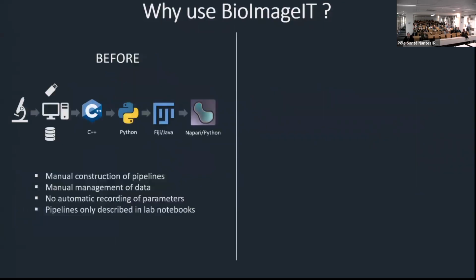Why should we use BioimageIT? Because there is here an example of a pipeline. You have your raw data, you stored it maybe locally or on a remote database, and you want to do some denoising or some deconvolution or tracking, and then you want to visualize your processed data. But you have to do it manually, so manual construction of the pipelines. You have to manually manage your data, and there is no automatic recording of the parameters, and the pipelines are only described in a lab notebook.